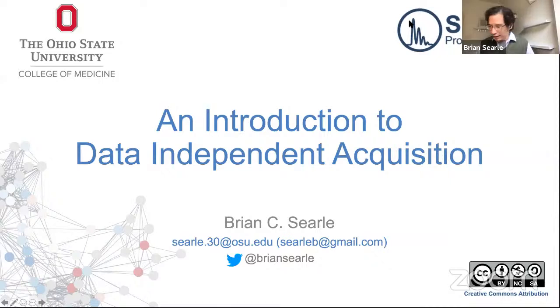Okay, so as Olga says, I'm going to give you a little bit of an introduction to data independent acquisition. And then after this, Lindsay is going to give a follow-up, a practical tutorial on how to start to interpret this type of data. So I'm excited for that. You should definitely see both of these sessions side by side.